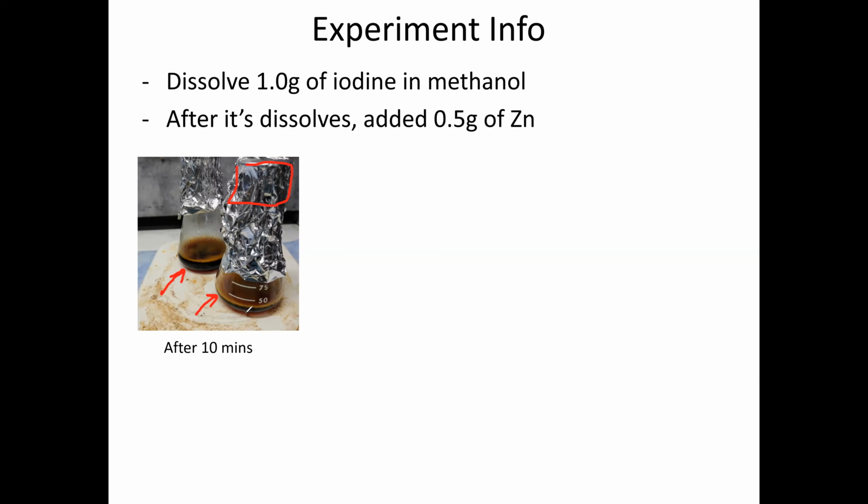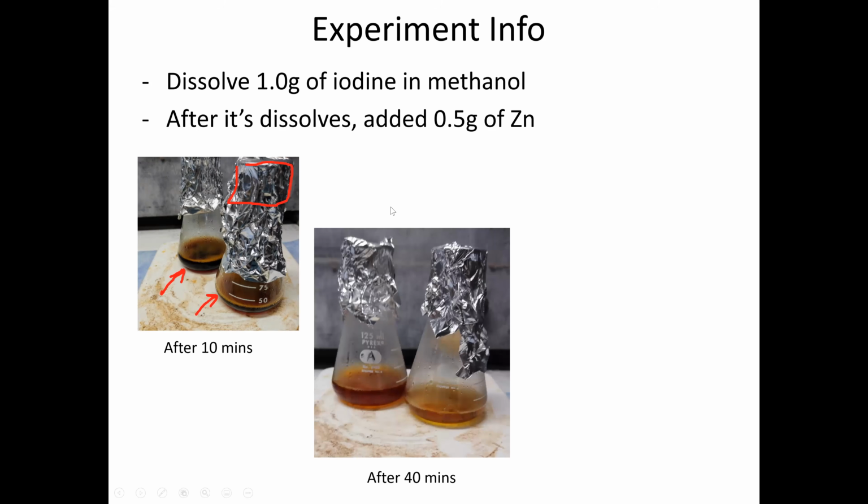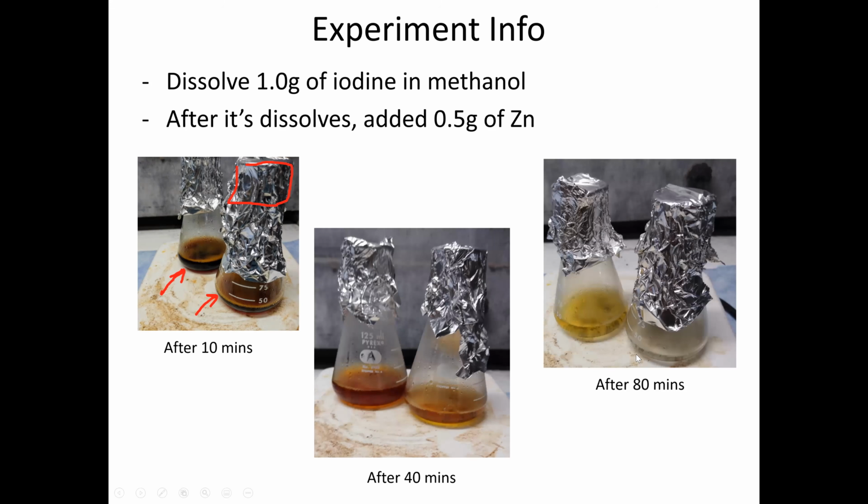So after about 10 minutes, it's still dark brown. After about 40 minutes, it's still brown. Again, we're waiting for that colorless or very pale yellow solution. And after about 80 minutes, you see one of them has gone colorless.